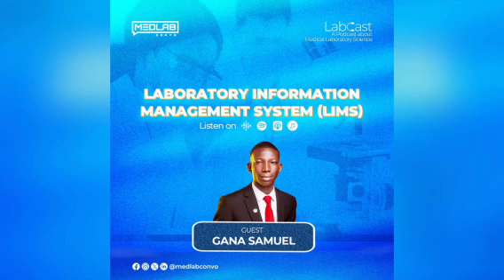And it started from just simple record keeping, where in the olden days we wrote on paper, got tired, and we had to think of better ways of keeping these things. Although one of the major reasons against paper recording was that anything could happen to it. And so making things electronic was just a good approach. And from there, we began to see different applications we could do with it.